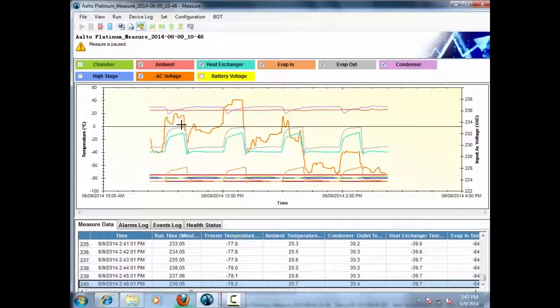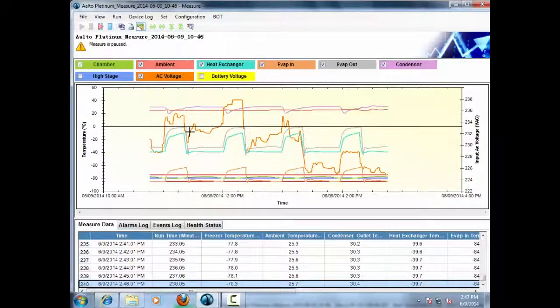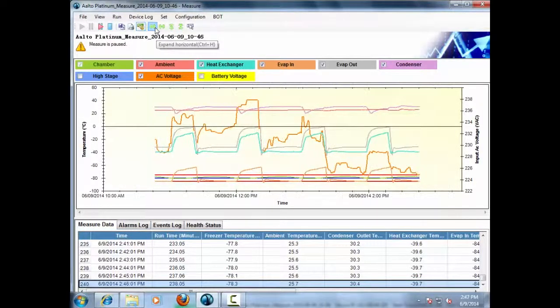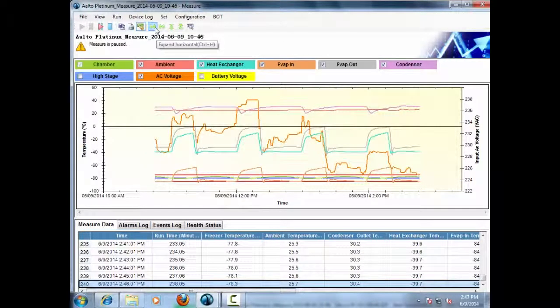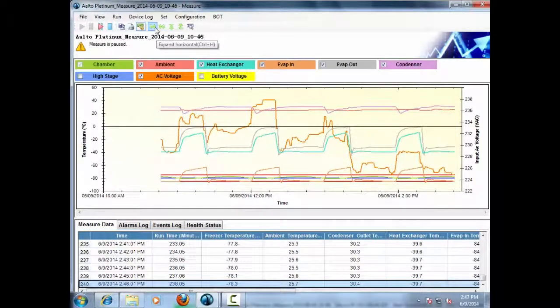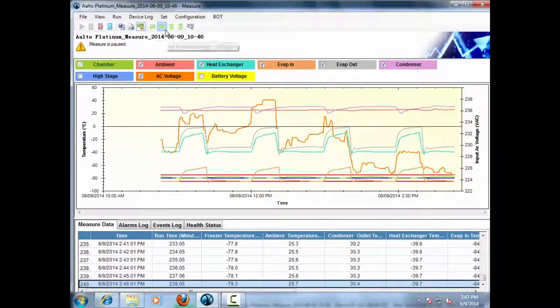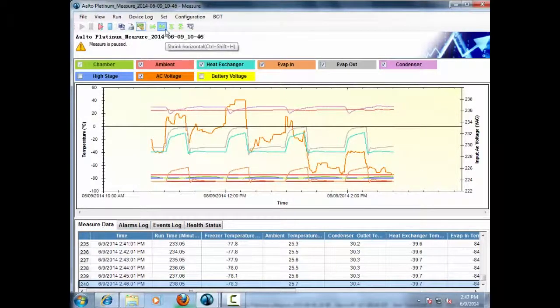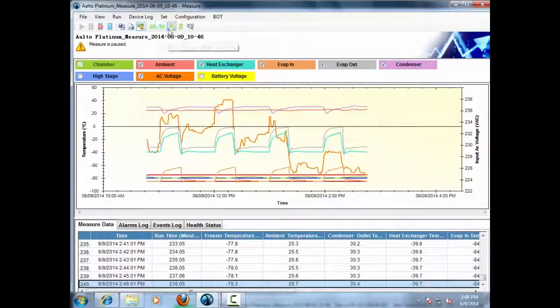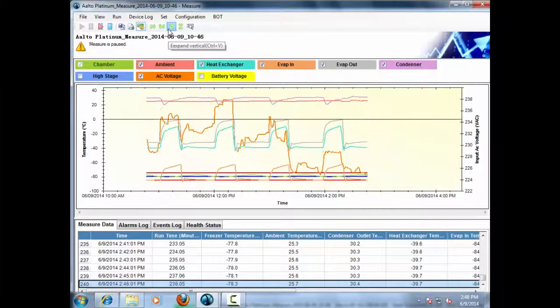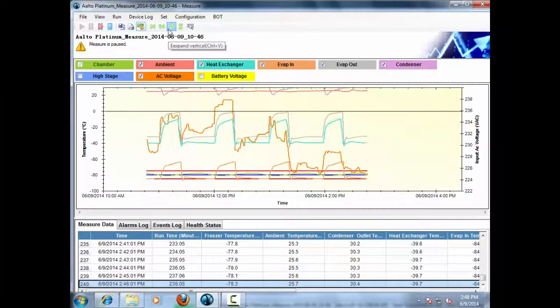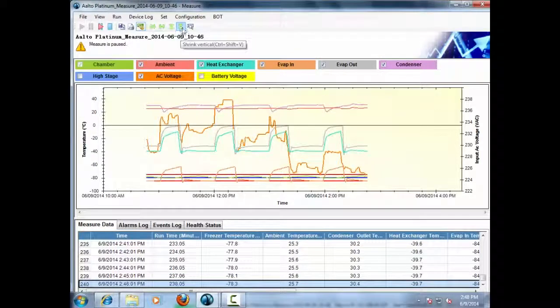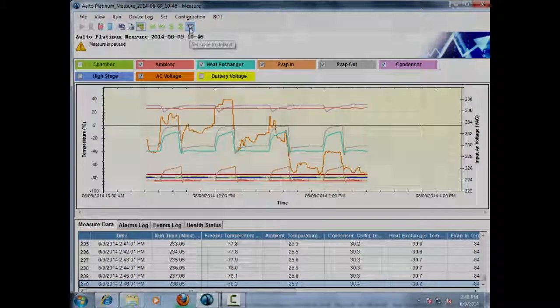Select SMS Modem Settings. SMS Settings tab consists of settings that will help Voyager application send SMS alerts to designated users. It also provides an option to send a test message to confirm the SMS settings. Configuration: read from device or write to device, and update program.